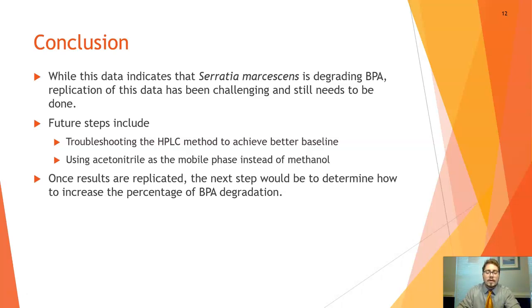So the goal is to recreate this data and try to expand on that, trying to get a better degradation rate, even though we got between 4 and 12% within those three samples.